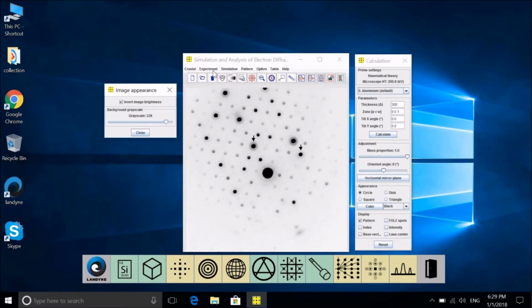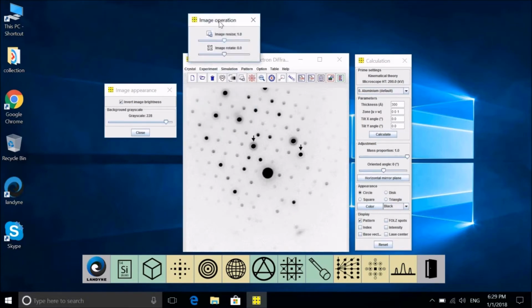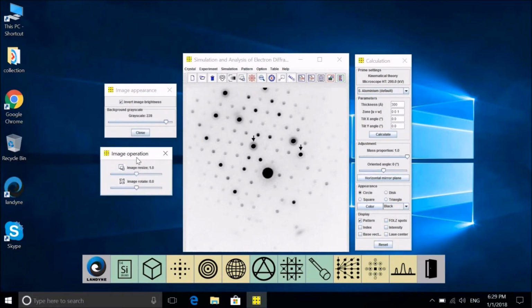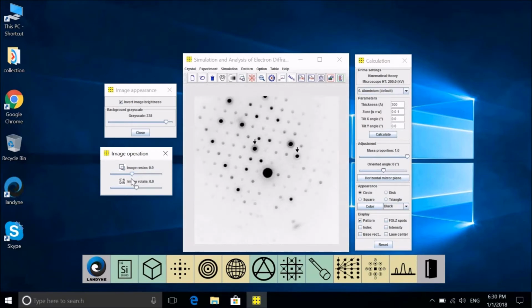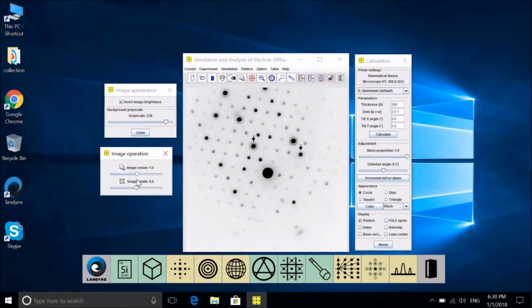And there are other things we can do, such as the resize one. If we want to resize the pattern, we can also cover the display area. Just make it slightly larger. You can see this point now comes to the edge, or even larger, and that will disappear. And if your original pattern is big, you can shrink it to small, that's also possible.